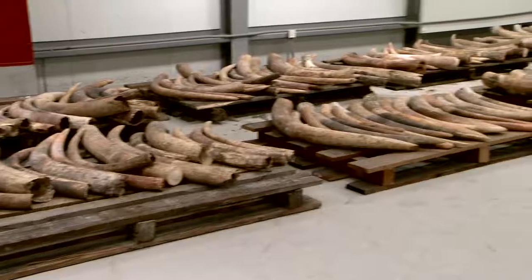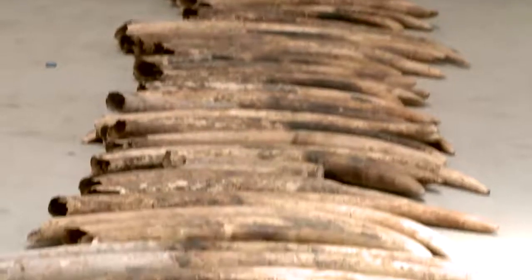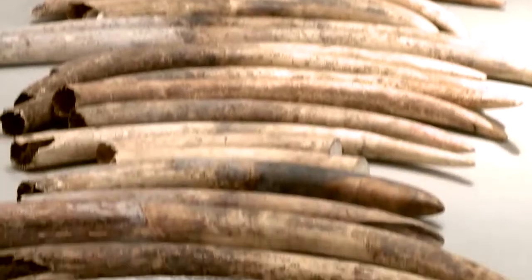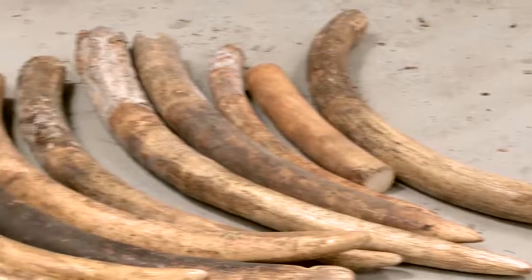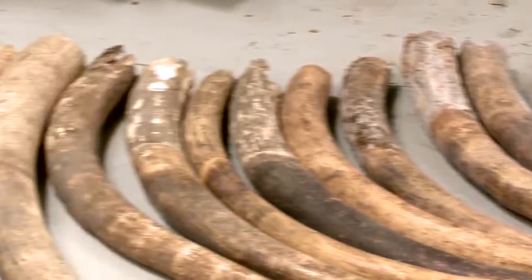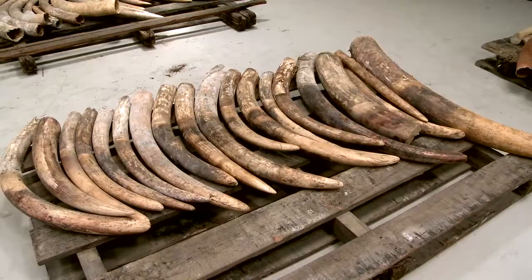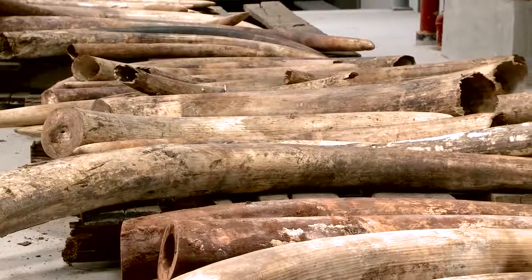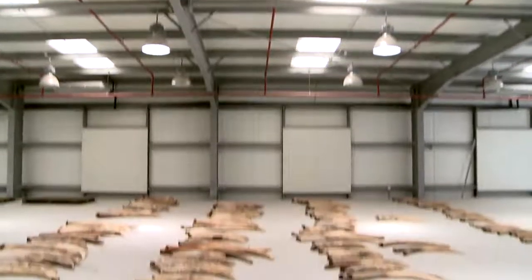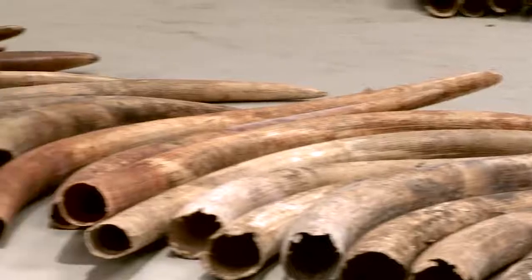Ivory seizures can range from one single item to hundreds of whole tusks and/or thousands of pieces of ivory. The ivory can come from many locations. It's not practical or necessary to sample every tusk for laboratory analysis. What is important, however, is to sample the ivory in a way that captures all the locations proportionately. Here we explain how to reduce the number of ivory pieces for sampling.